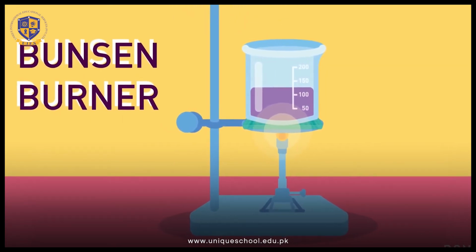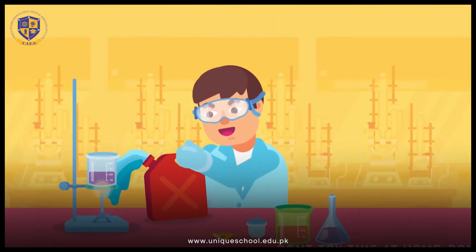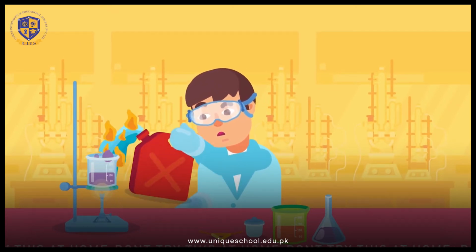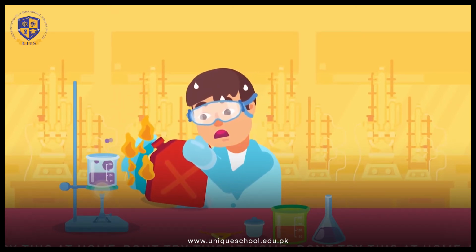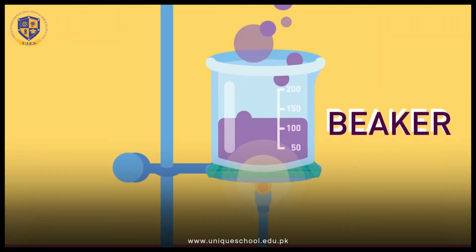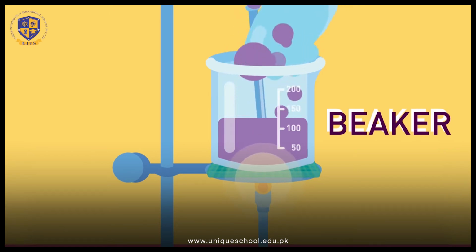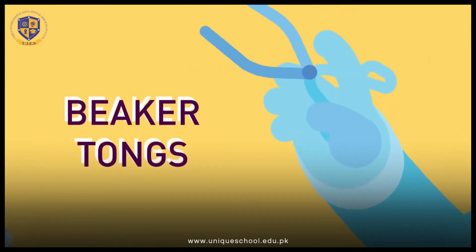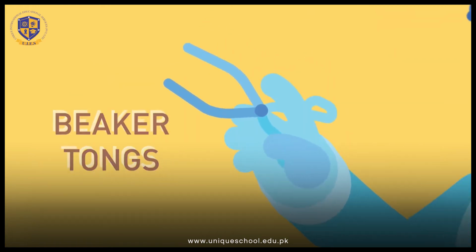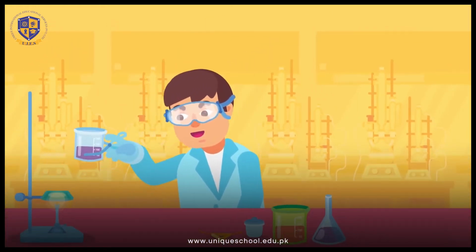Bunsen burner. Be careful not to put flammable materials like a cloth or chemicals like aromatic compounds such as petrol anywhere near it, or this may erupt into a fire. Beaker. A beaker is a glass apparatus used to hold, mix and heat liquids. Beaker tongs. Metallic and looks like a scissors' older sibling. Beaker tongs are used to handle beakers.